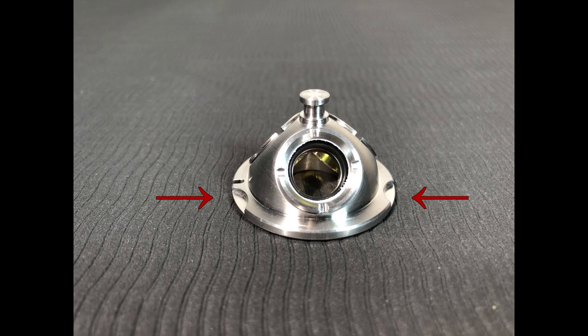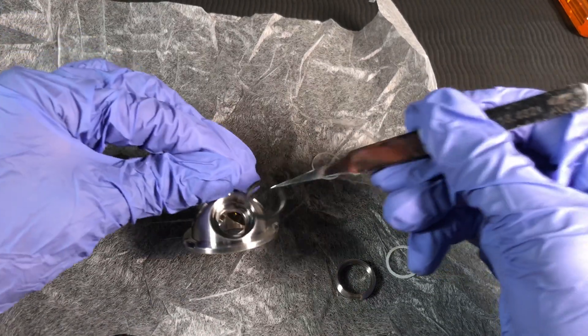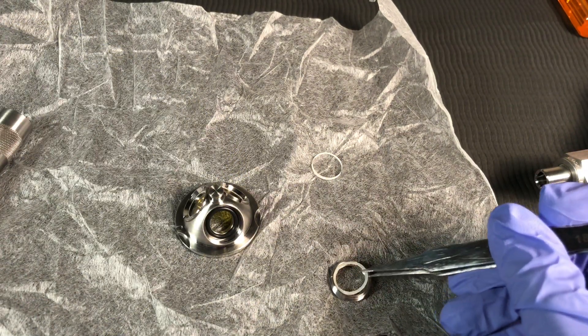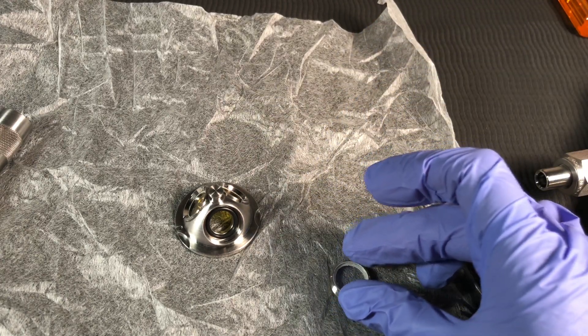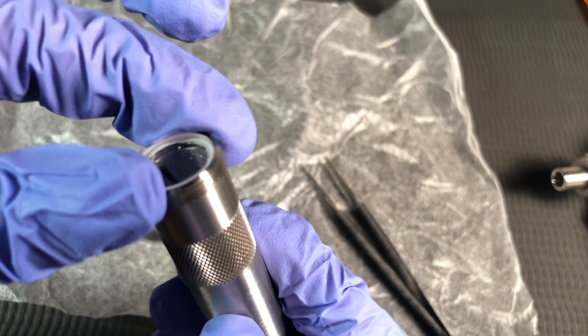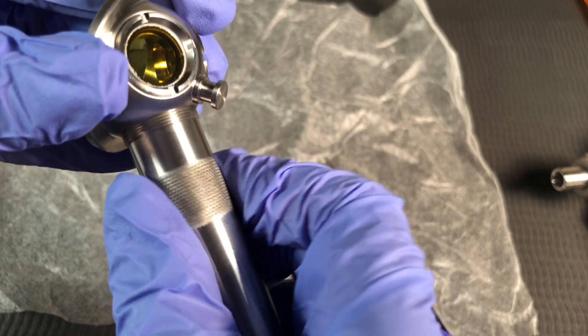If the windows are not already installed or need to be cleaned or changed, follow these steps. The observation window is located between the two semicircular indentations on the rim of the dome. Insert an O-ring into one of the window ports — use plastic tweezers to avoid damaging the O-rings. Hold the retaining ring upside down, place a PTFE washer inside, then carefully place a window on top of the washer. Hold the retaining ring to retain the window, thread it into the window port, and tighten using the provided tool.